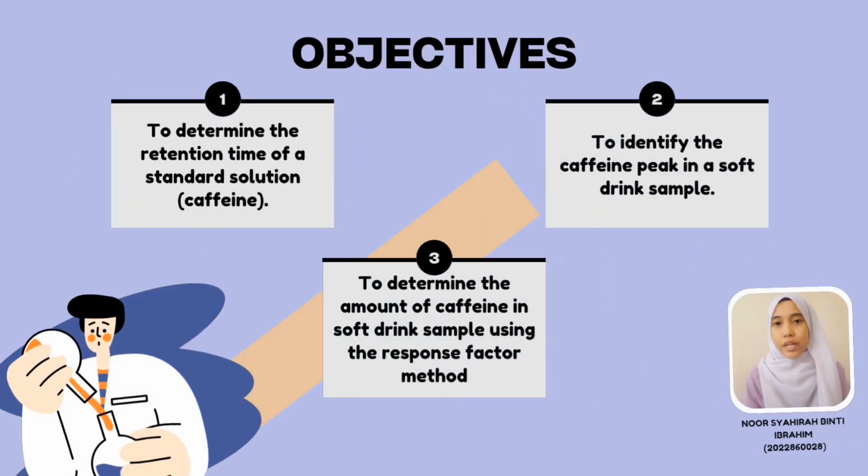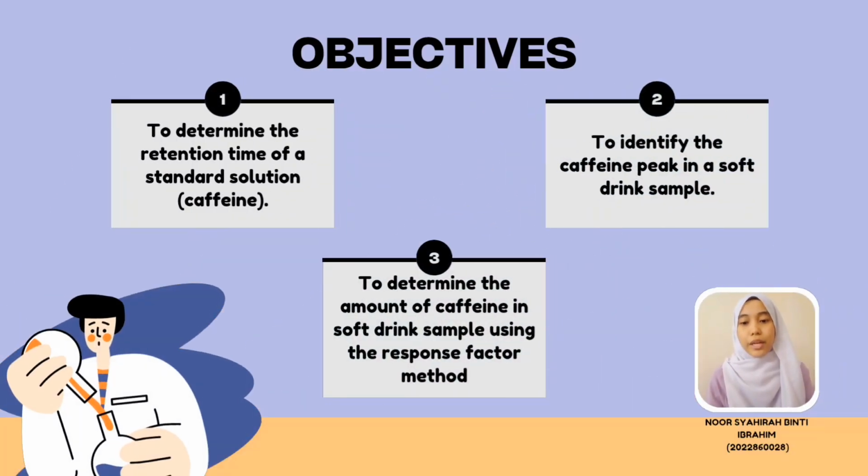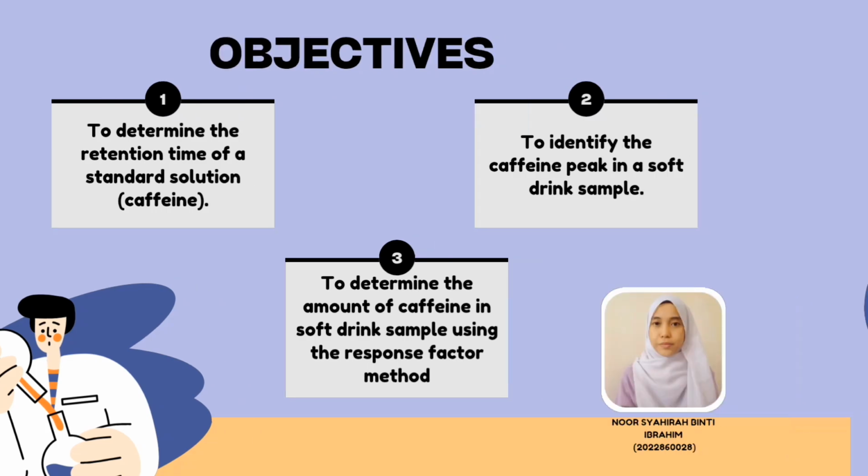The objective of our experiment is to determine the retention time of the standard solution caffeine, to identify the caffeine peak in the soft drink sample, and also to determine the amount of caffeine in the soft drink sample using the response factor method.